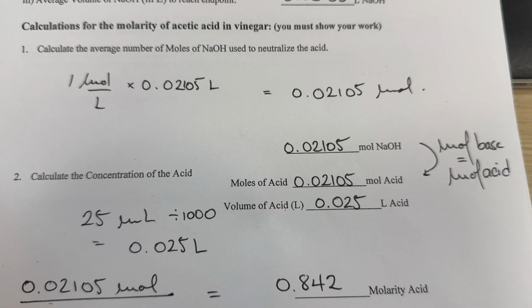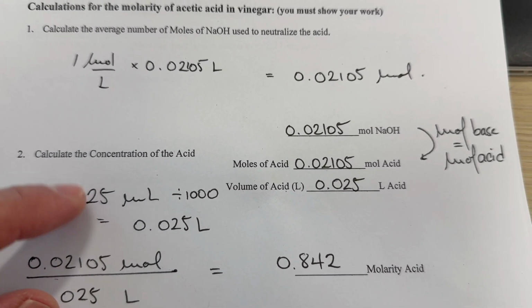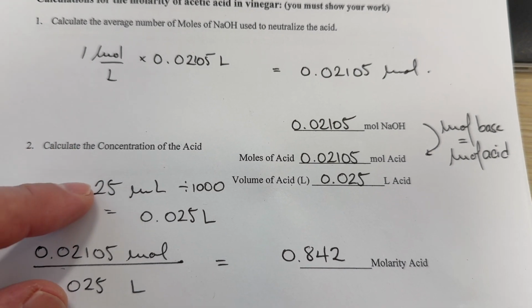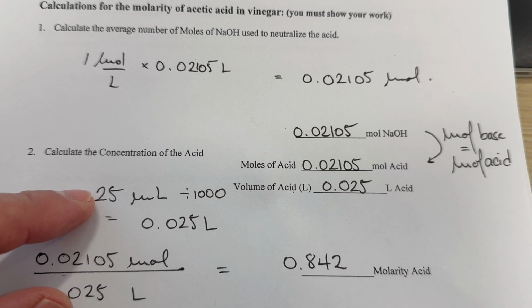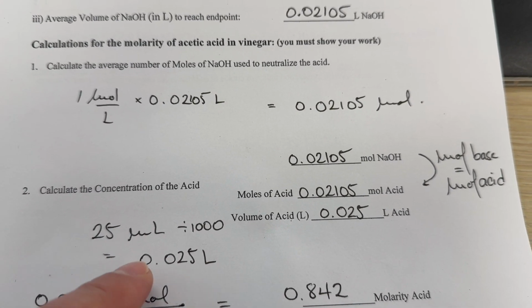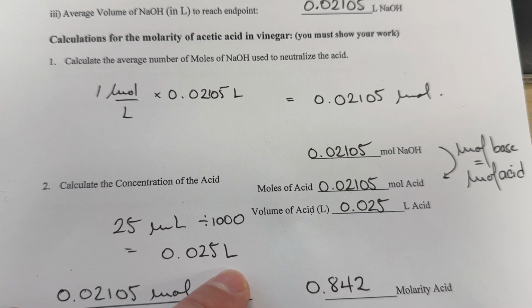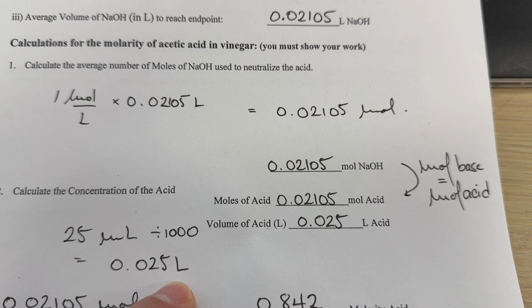And the volume of the acid was carefully measured at 25 milliliters. That's the vinegar, right? So we had 25 milliliters of vinegar. Again, we divide by 1,000 because there are 1,000 milliliters per liter, which gives us 0.025 liters.